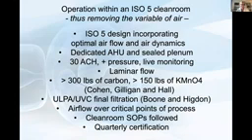We employed ULPA filters, that's just a step above HEPA, continually bathed in UVC light. We had airflow over critical points of process, followed clean room SOPs. I can tell you those suits are not comfortable to wear and are quite warm. And we were certified quarterly.